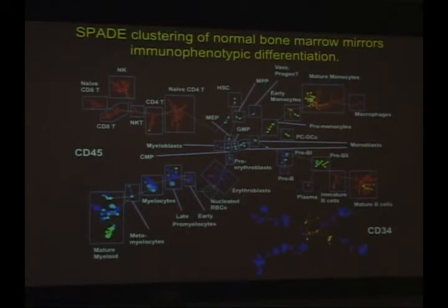And if you choose different markers to cluster, you will get different patterns. These patterns are derived by what markers you chose to cluster on. Obviously, we tend to choose the things that are going to separate the data the best. But if you choose different things, you get different branches. If you choose a ton of myeloid markers, you get like 15 different myeloid populations. You get different myeloid arms. If you choose a ton of T cell markers, you only have like one myeloid arm, and you get like 10 different T cell populations. So it's just immunophenotypic relatedness.